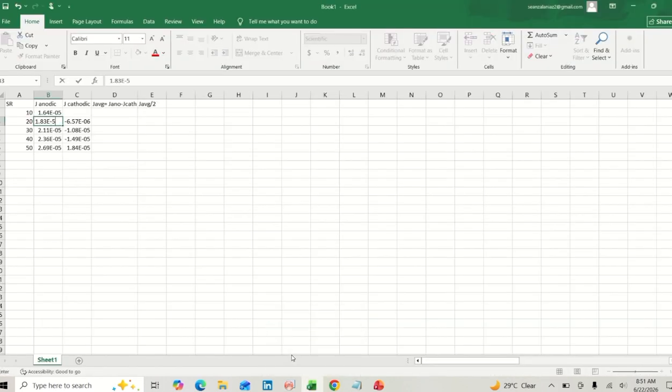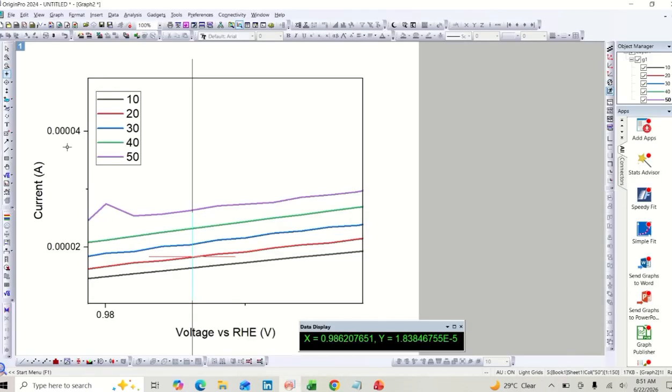Also notice that if your graph is overlapping, you can also draw two lines at the wider ends of the curve. As you can see, our graph is not overlapping, so I proceeded with a single line.